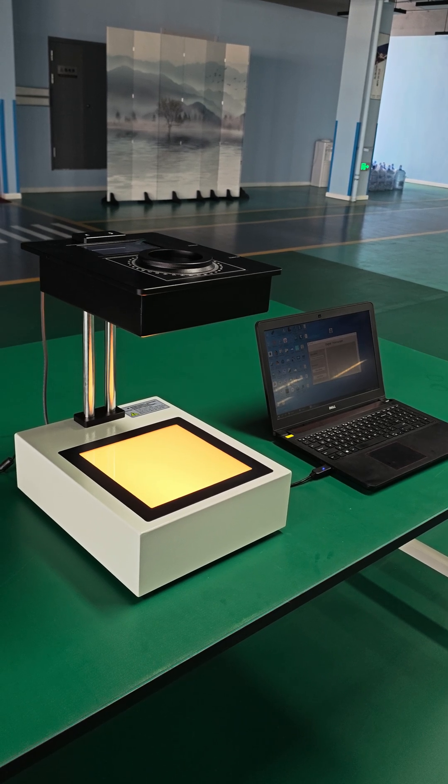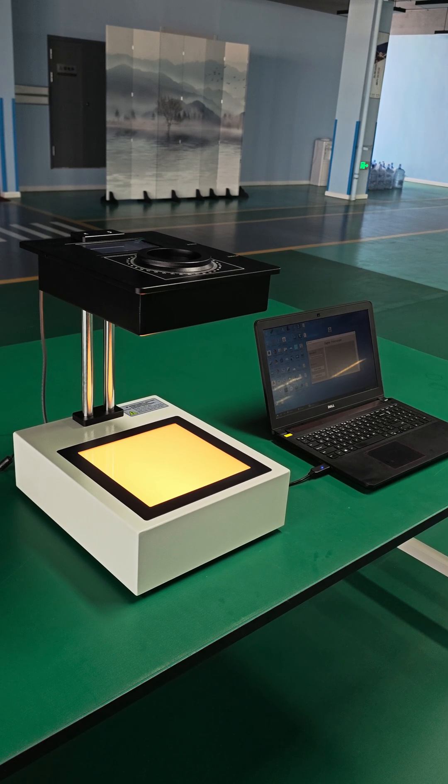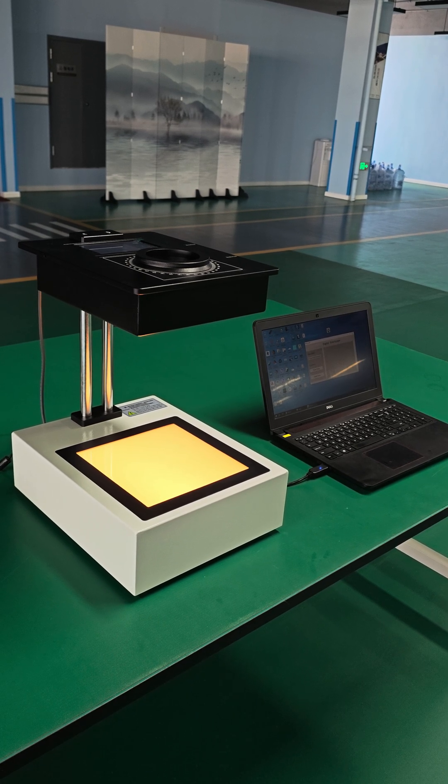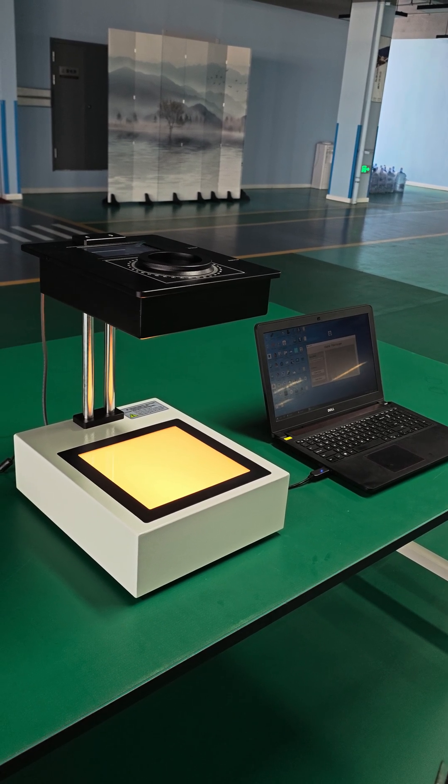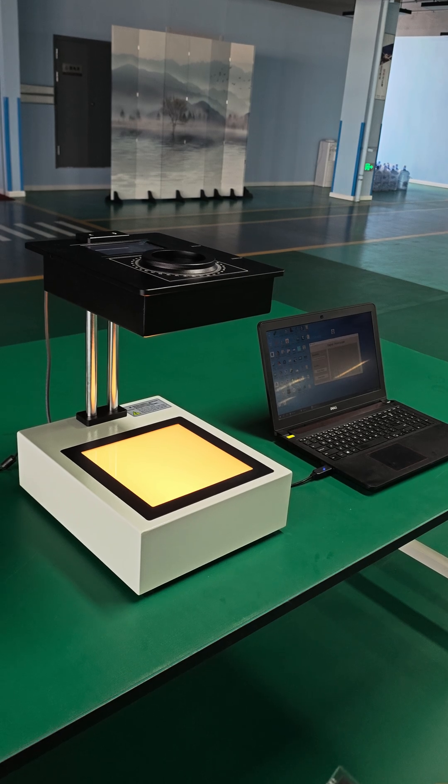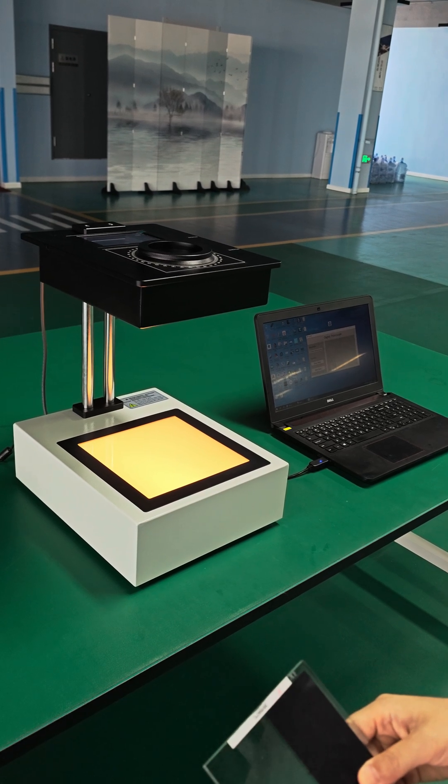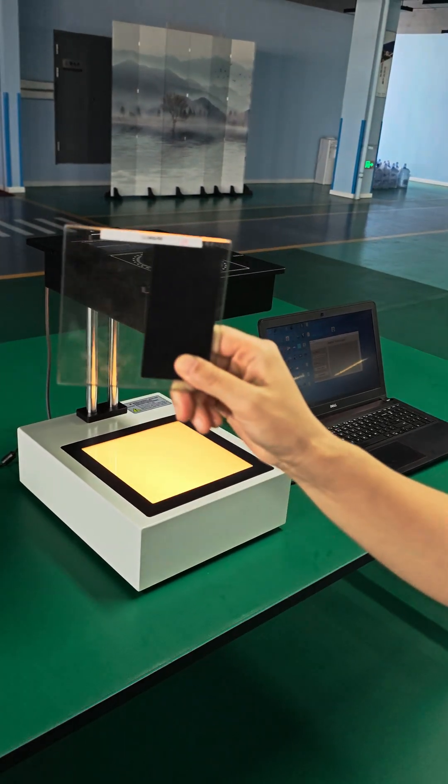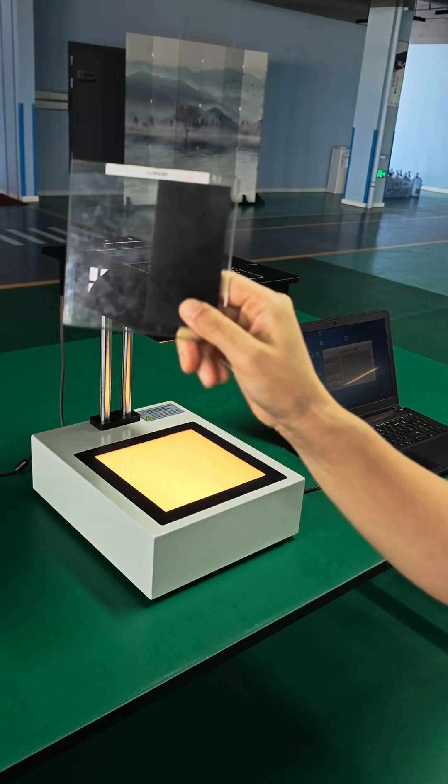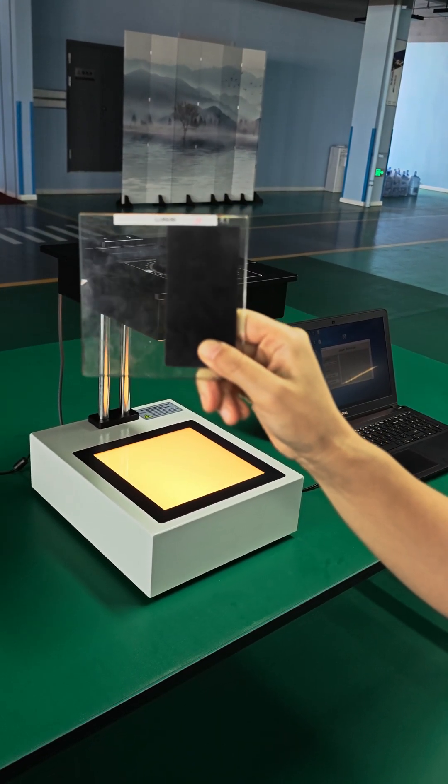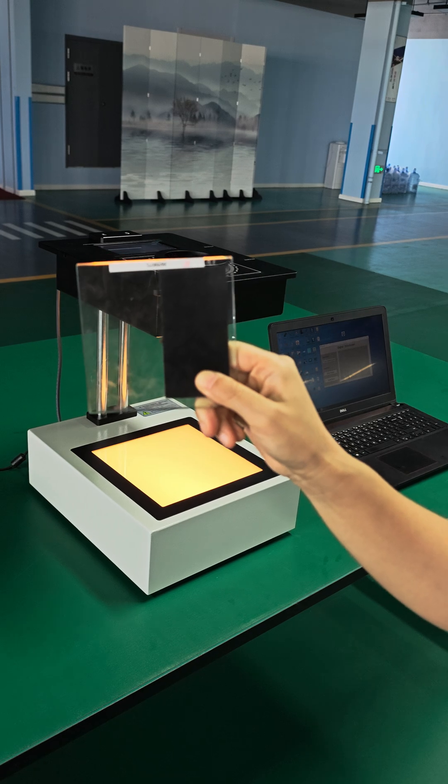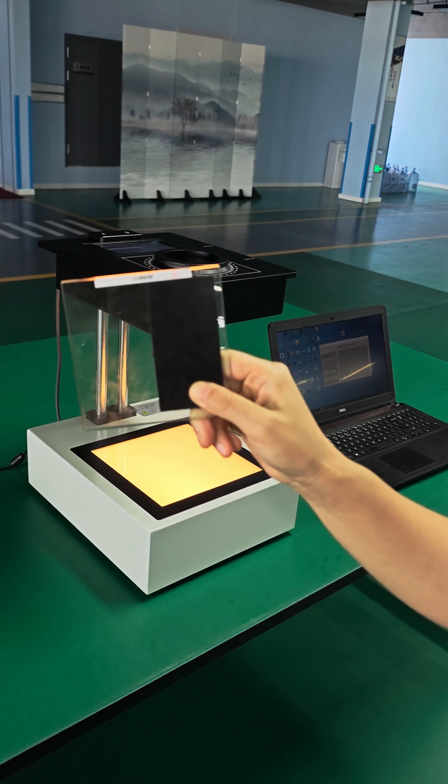This is the digital polariscope from PTC. In the following, I will show you how to use this polariscope to measure stress-related value within this glass sample.